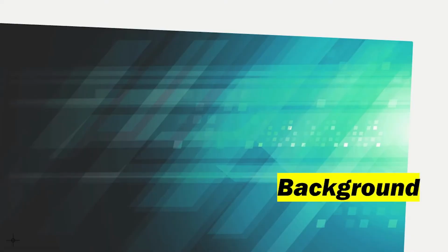Hi, my name is Lara Brindisi, and I'm a PhD candidate at Rutgers University in Dr. Jim Simon's lab, and I'm going to be demonstrating how to create a ddRADseq library. This method was originally developed at Cornell University by Poland et al. in 2012 and was later adapted for sweet basil by Pine et al. in 2017 at Rutgers University.